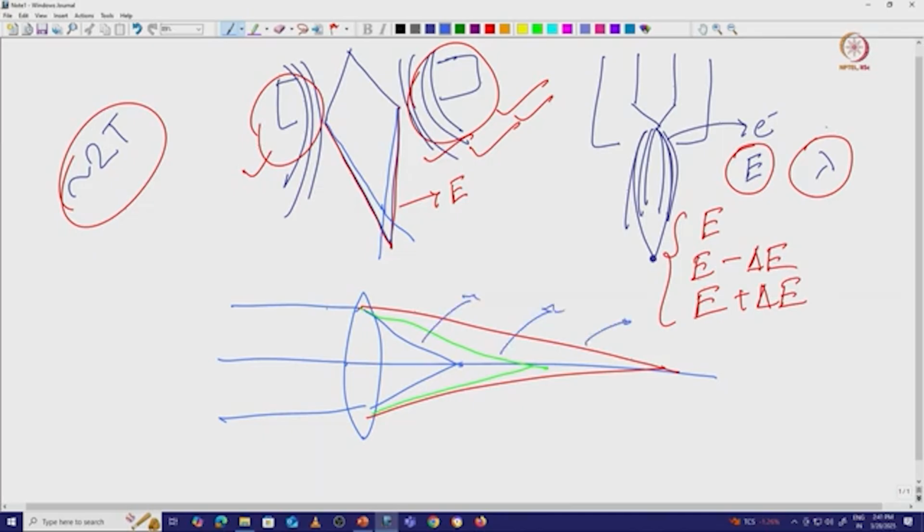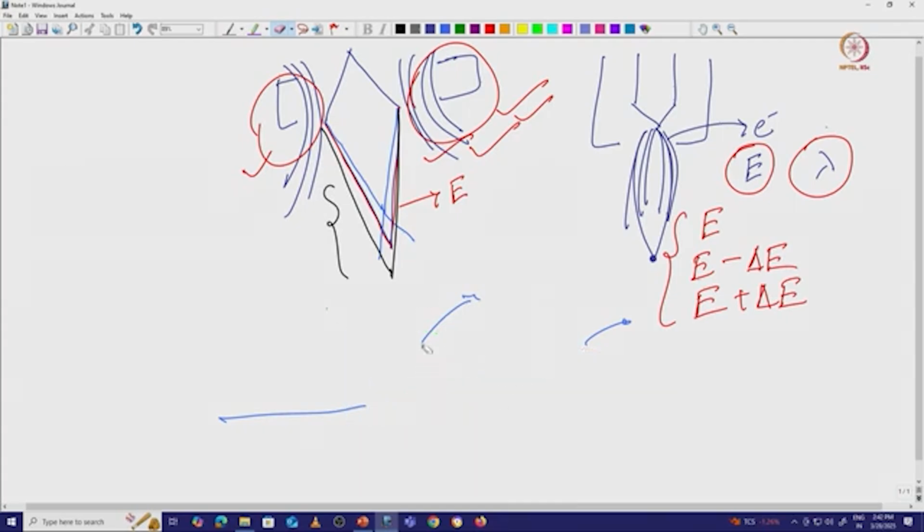Here you cannot see a reddish, greenish or bluish appearance, but due to the energy difference there are some changes in the magnetic field. In one case you can see that the lines converge somewhere here. So we can observe a similar pattern in this particular case also. Now if we want to draw it properly, we can get it like that.